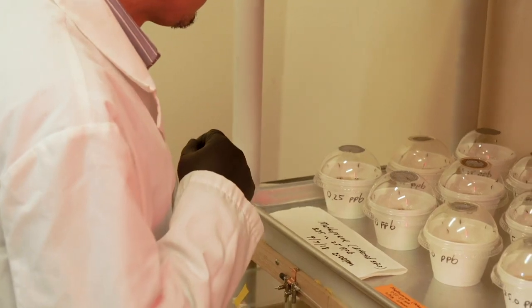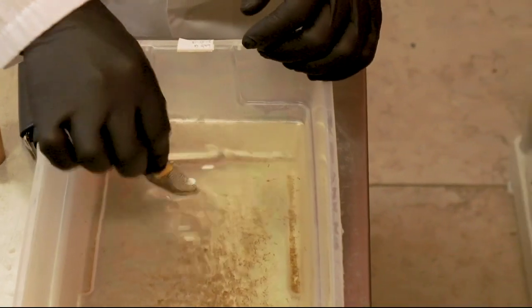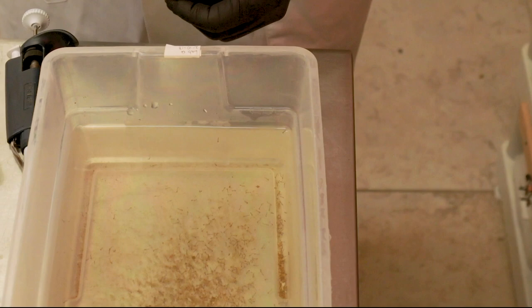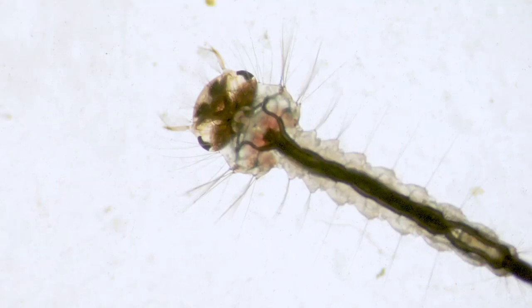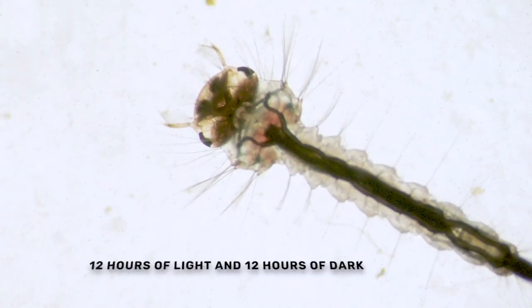The bioassays are run under a known temperature regime, typically 25 to 28 degrees Celsius. Sometimes, slightly warmer conditions are maintained in mosquito insectaries. A continuously recording temperature sensor can be purchased fairly cheaply. Alternatively, a recording maximum-minimum thermometer can be used to keep track of the temperature extremes during the experiment, as ambient water temperatures are critical during exposure for ingestion and cuticle absorption of pesticides by mosquito larvae. The photoperiod recommended by the WHO for bioassays is 12 hours of light and 12 hours of dark.